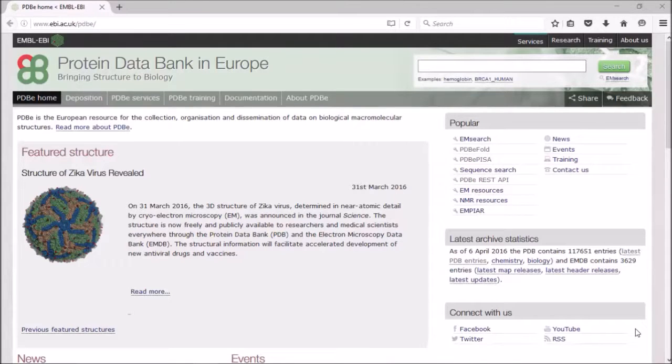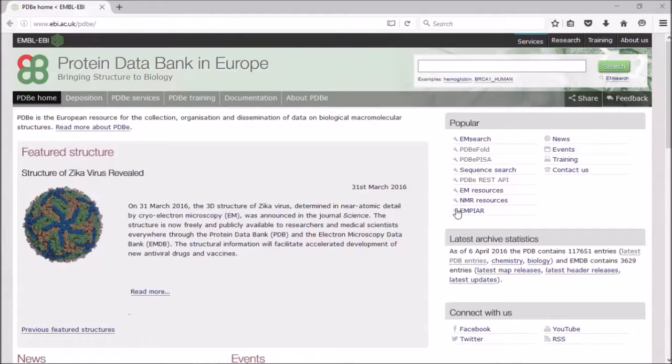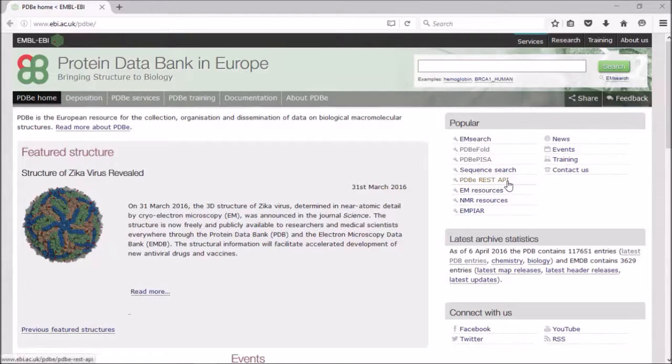We have an API here at the PDBe for programmatical access to the data. This link here will take you through to our API pages.